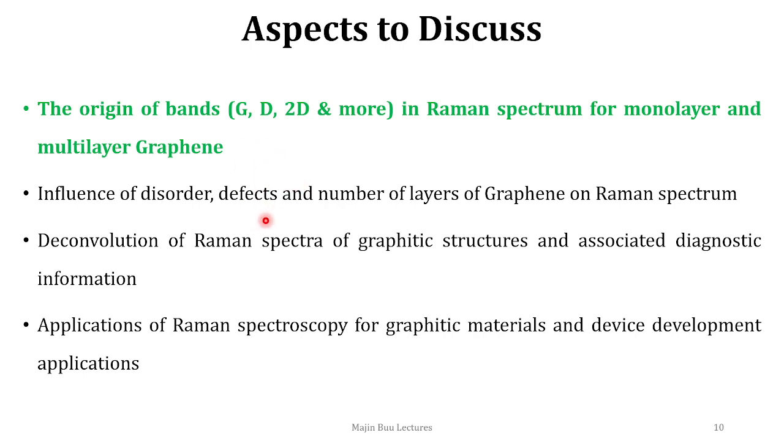While most of these works are carried out from an engineering perspective with an application focus, you will have Raman spectroscopy mentioned in the research papers, just giving a glance of the quality of the graphene being used. While that is fine, it is very helpful to get a physics-oriented perspective, that is, the electronic transition perspective of the associated G band, D band, and the other bands that occur in the Raman spectrum of graphitic materials.